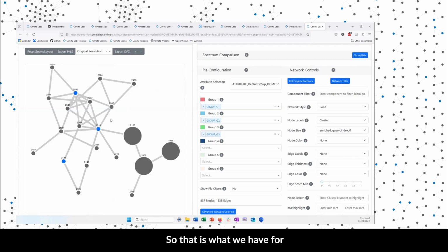So that is what we have for today for the workshop part. As always, you are free to check out all of the different results that we have on this server, check out the documentation, get to know it a little bit better. But for now, I'm going to hand it over to Helena to talk about some of the cool things that the Center for Microbial Collaboration, Helena, you're going to have to help me out with that acronym again, is doing to help improve these library annotations and give a lot more publicly available stuff for the community.